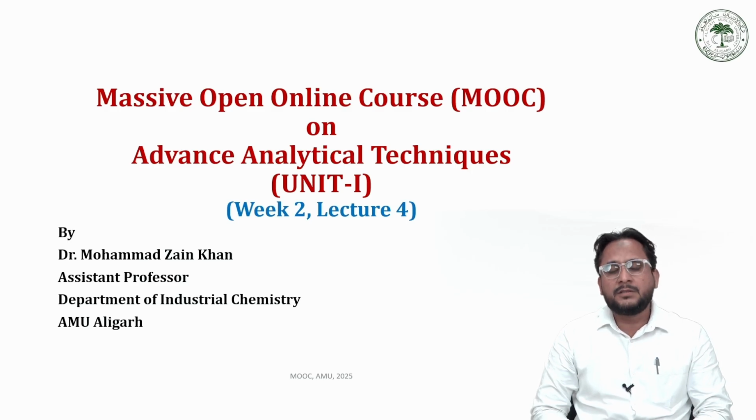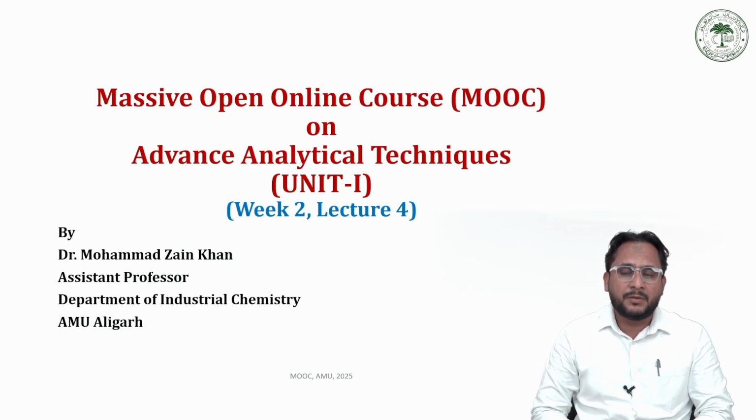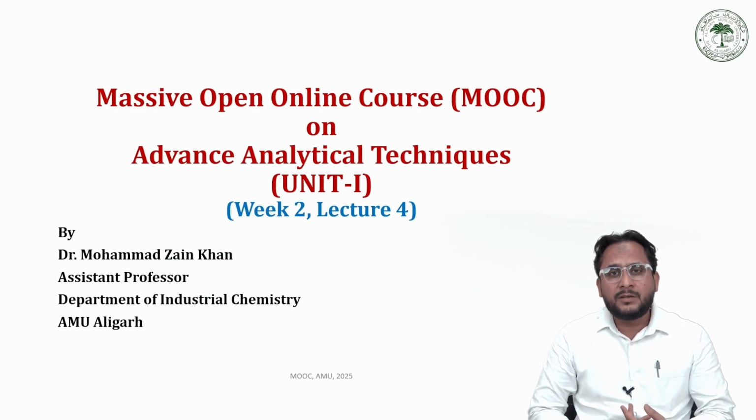In the previous few lectures, we have completed the emission and absorption spectroscopy. We have covered absorption spectroscopy, its instrumentation, working principle, and the different components that are used in atomic absorption spectroscopy. In addition, we have also discussed the various types of interferences that are quite common while doing analysis using AAS, and a few ways to minimize or prevent those interferences.